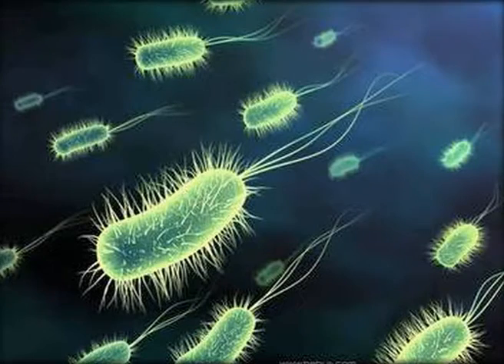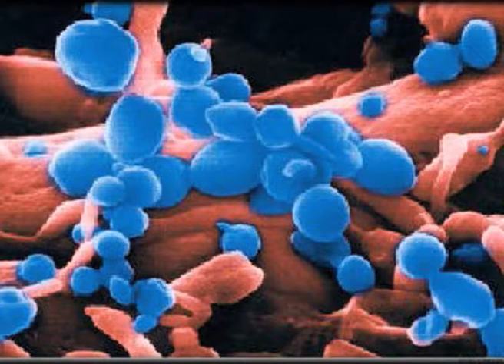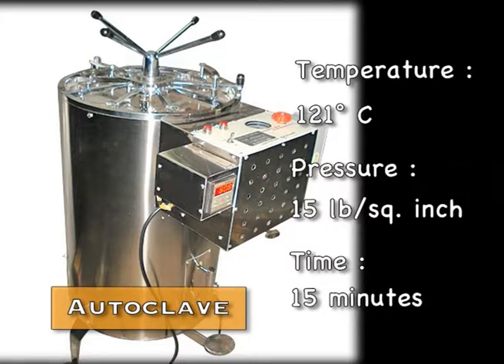Sterilized steam is used for killing of the microbes. In autoclaving, we see that the microbes are getting killed at a temperature of 121 degrees centigrade and a pressure of 15 pounds per square inch.